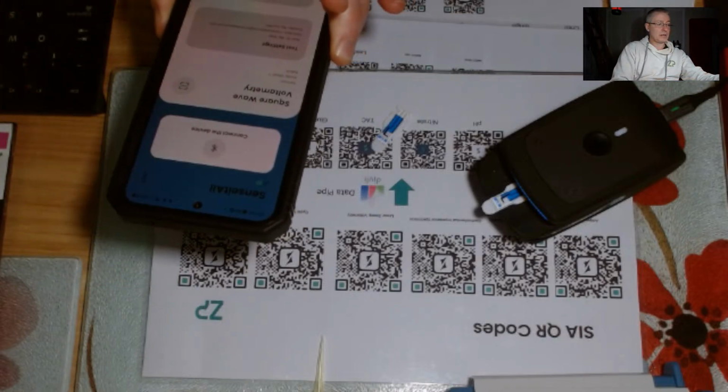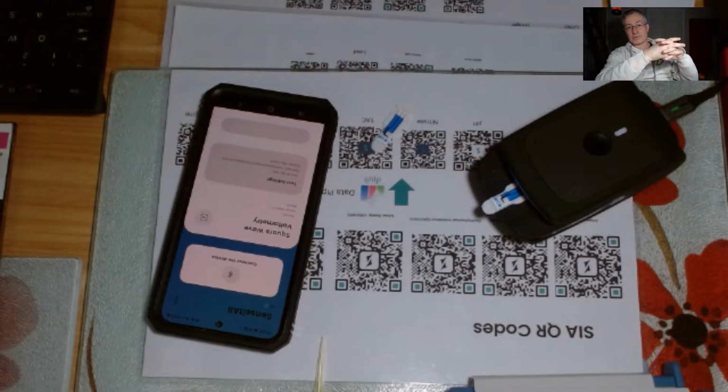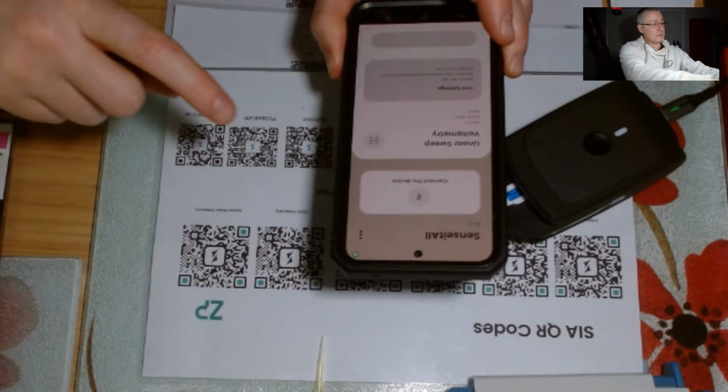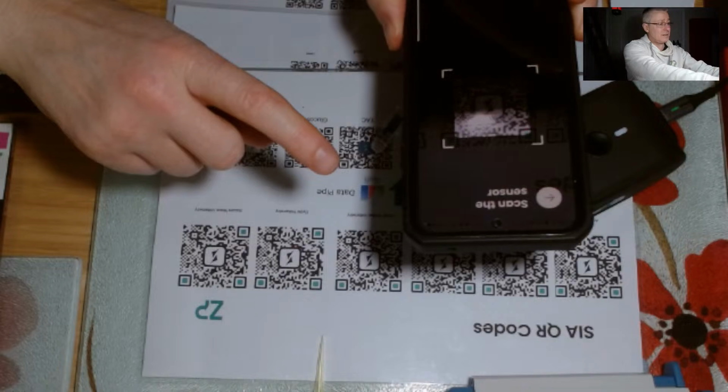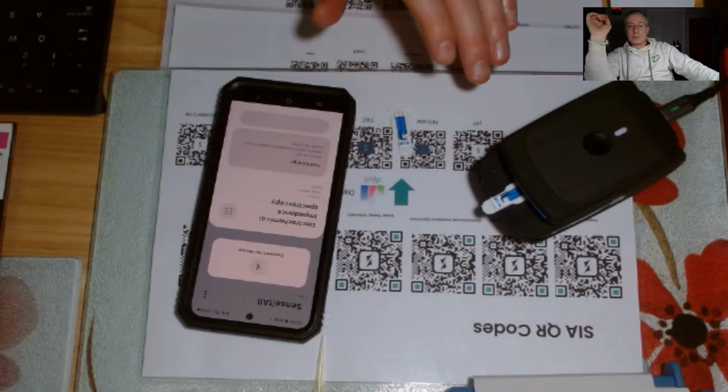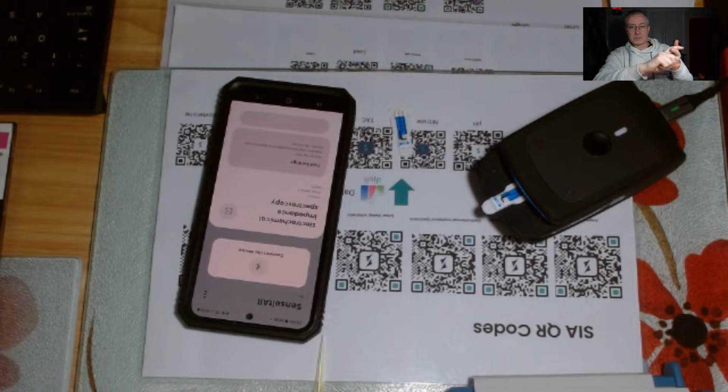I think it's a personal preference for me, but I also quite like square wave voltammetry. In fact, they could have also used EIS as well, impedance spectroscopy. The reason I bring those up is just because differential pulse voltammetry, my personal preference is square wave voltammetry. They're pretty similar. And then sometimes if you want an extra bit of sensitivity, EIS. But EIS can be a little bit too sensitive. But all that said, their mechanism is basically a blocking assay. So when they have binding, the signal slightly goes down, and that's what's happening in that particular paper.